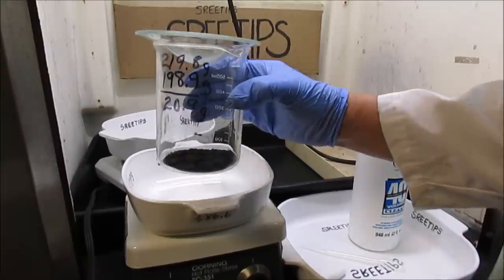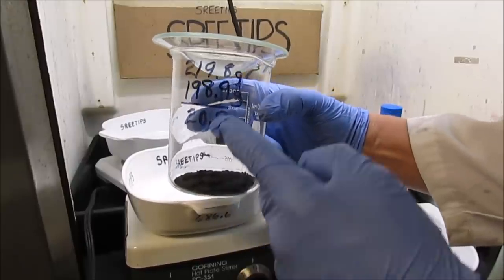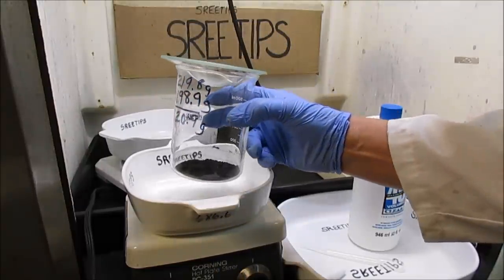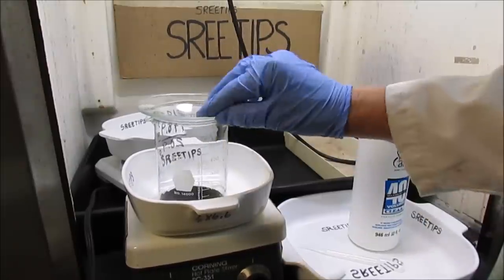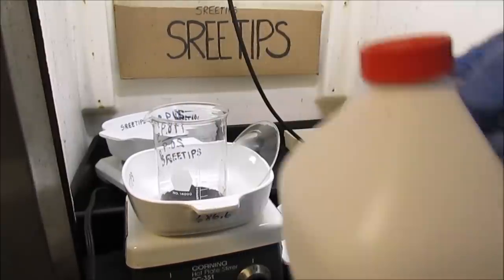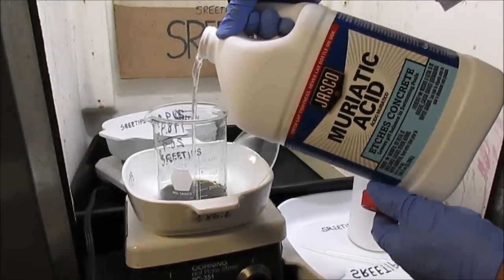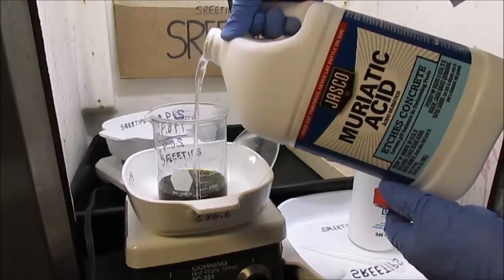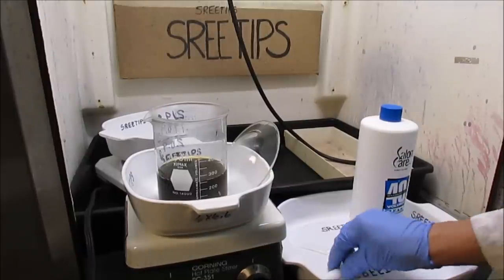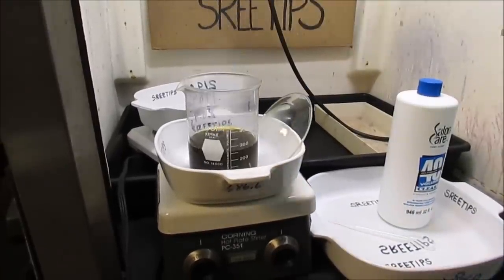To start this experiment, I've got my beaker with my mixed black PGM metal. The weight of the dried metal powder is 20.9 grams, and that's critical because I need to know that weight in order to do this successfully. What I'm going to do is start off by adding about 250 ml of hydrochloric acid. I've got a magnetic stir bar — this is a magnetic stir with a hot plate — and I'm going to go ahead and put my stir bar in and start stirring.